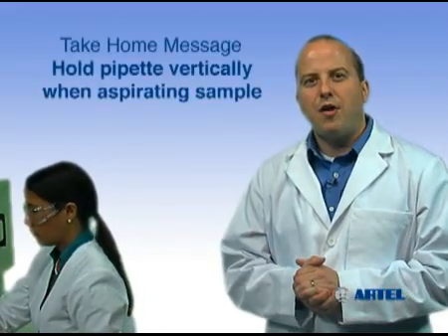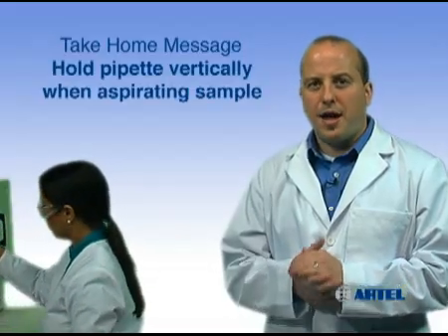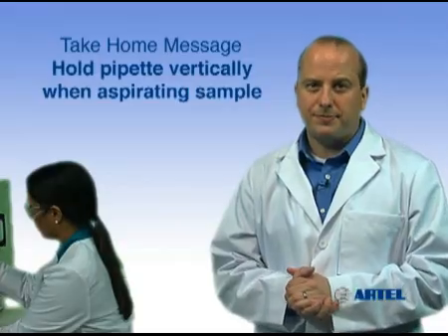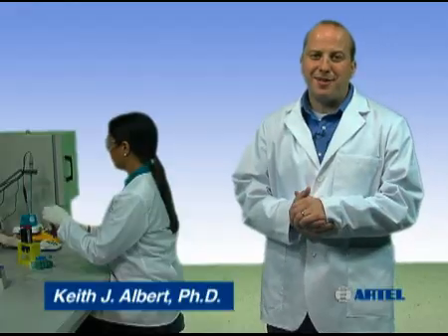The take-home message is: during sample aspiration, always hold the pipet vertically and avoid touching the sides of the container. After sample aspiration, pull the pipet straight out of the liquid. Proper pipetting technique can help you ensure liquid handling quality in your lab.